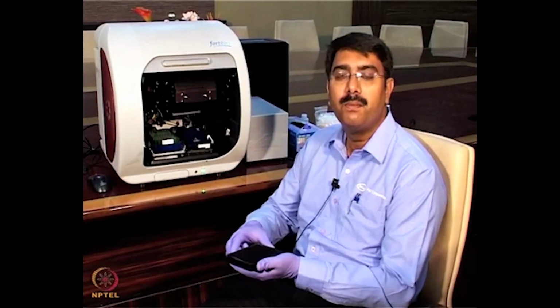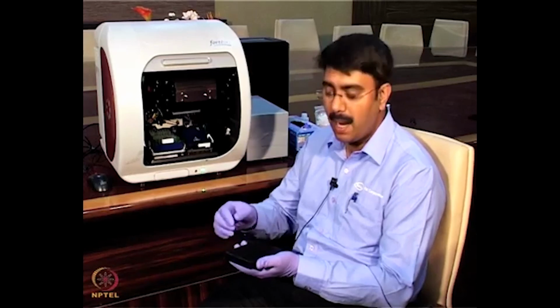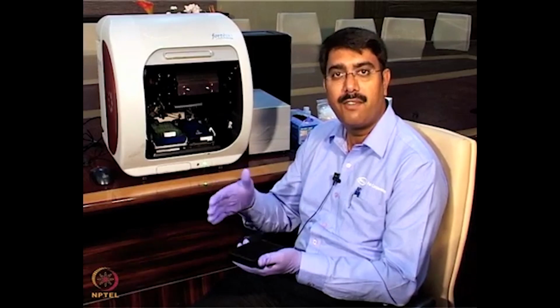I am going to demonstrate the kinetics interaction of a mouse monoclonal antibody to the protein A ligand. Here I am using biotinylated protein A as a ligand, at a concentration of 10 microgram per ml, which I am putting into the 6 wells. The mouse monoclonal antibody I am using as an analyte. I am taking the starting concentration at 25 microgram per ml, and I am going to do a two-fold serial dilution from 25 to 12.5, then continue serially for 6 data points.